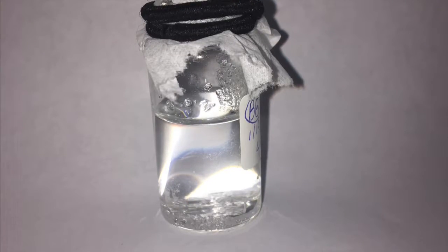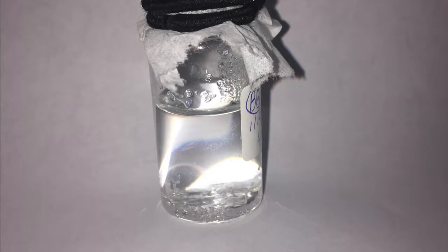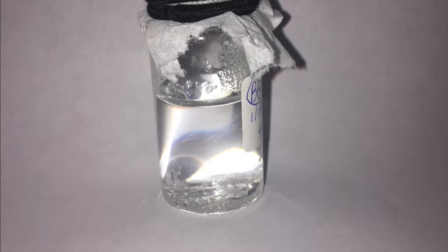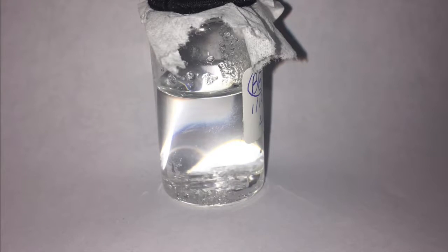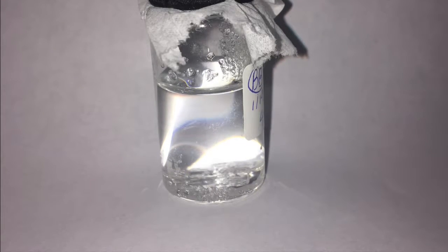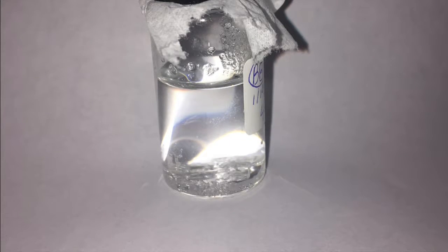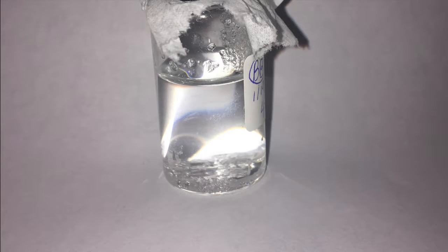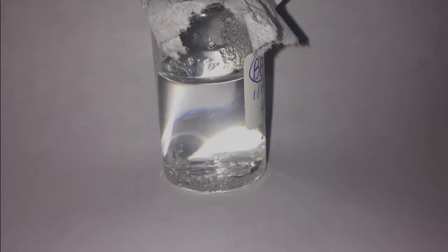Environmental factors that can explain the overall appearance of the crystals can include the agitation that was imparted on the vial when the crystals were moved away from its original location, next to the lava lamp. While this new location allows the crystals to grow more effectively because excess heat is not being imparted on the solution, the movement may have caused difficulty in the crystal's growth.